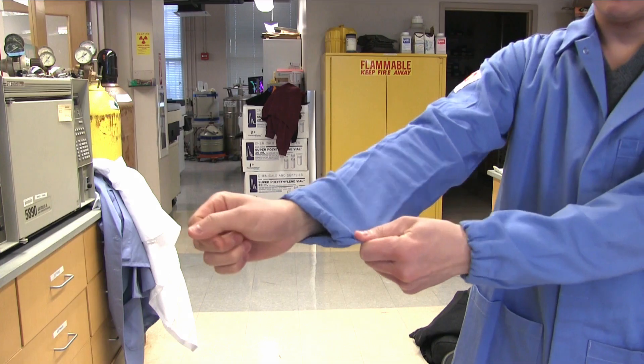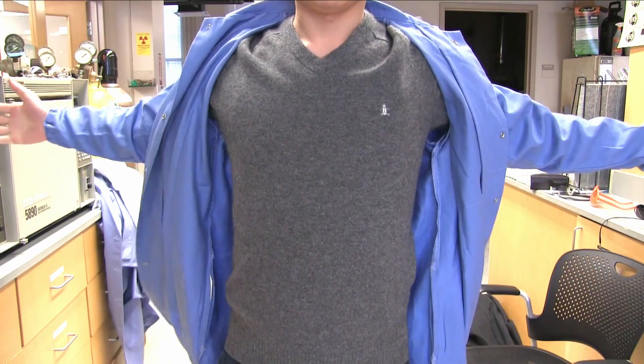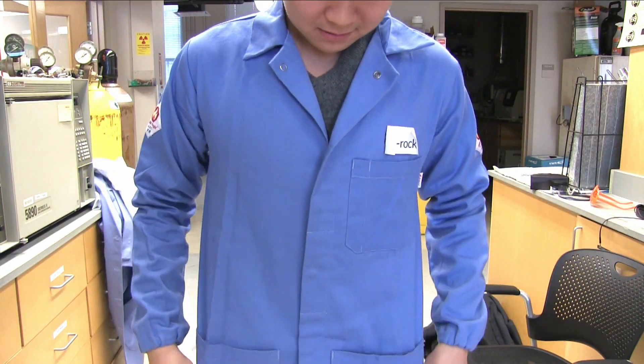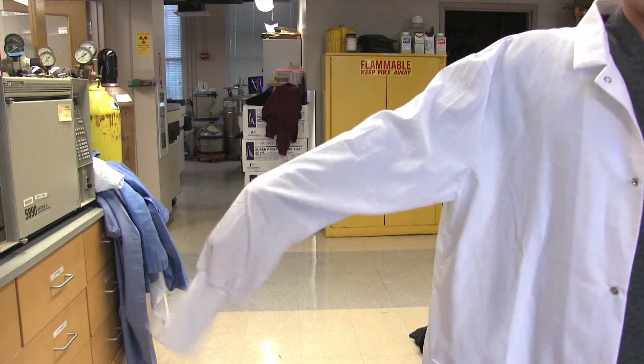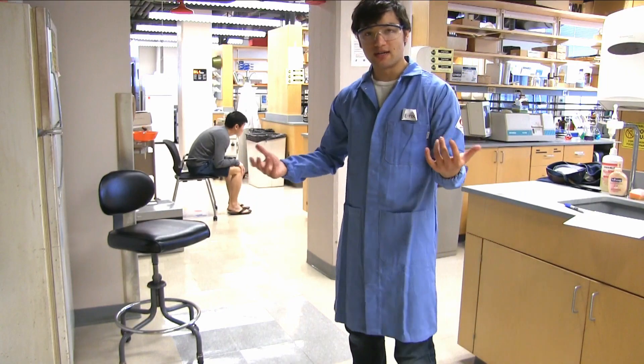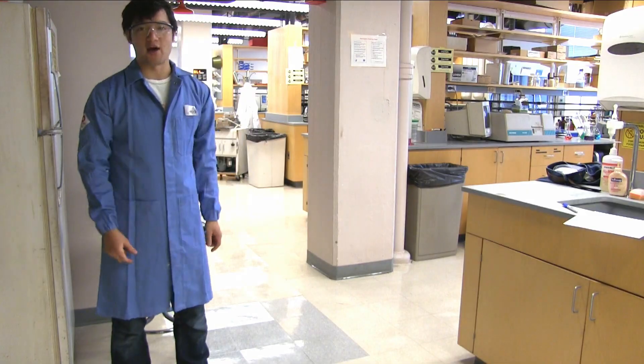Coats come in a variety of styles, tight cuffs for the wrists, and snaps for the quick strip. Give your coat a try on to see if it fits properly. Too big, and you'll be doing your research sloppily. When in doubt about where you need it at lab coat, seek EHS, and they'll come to help you out.